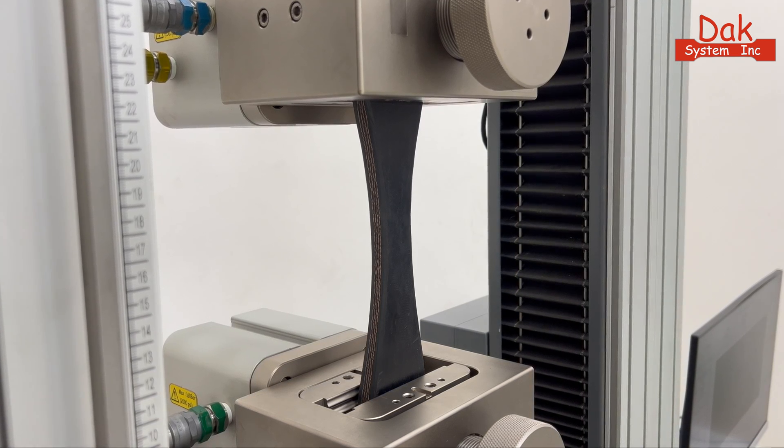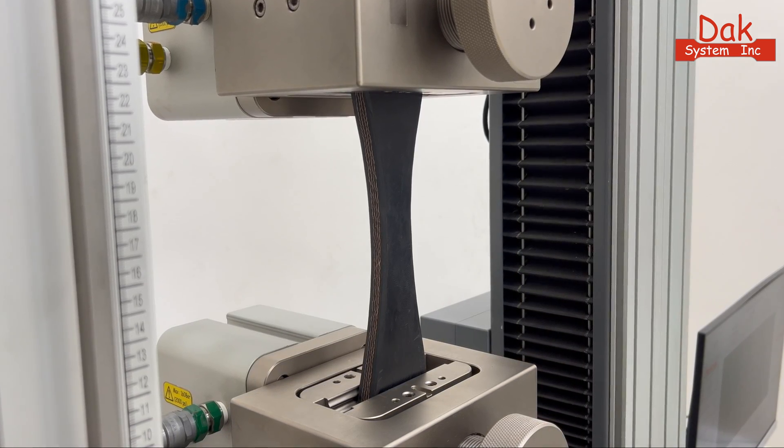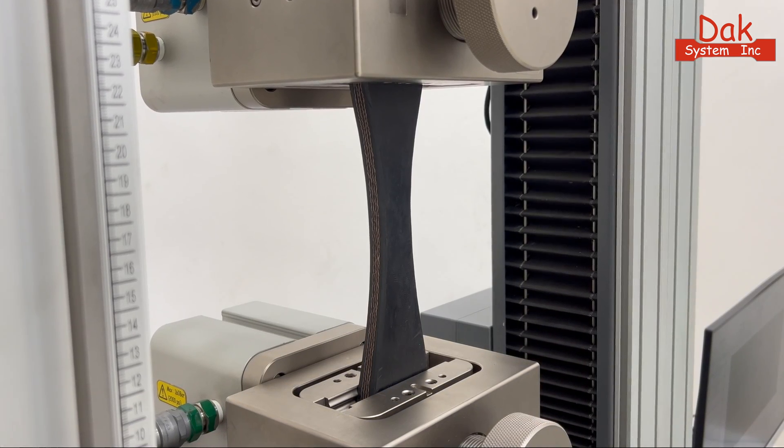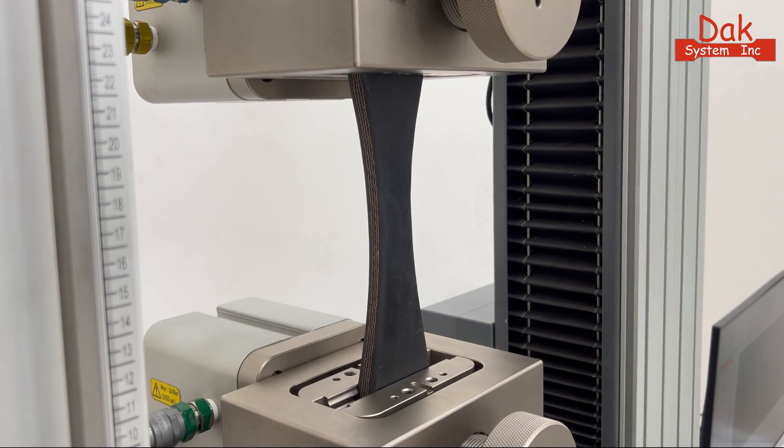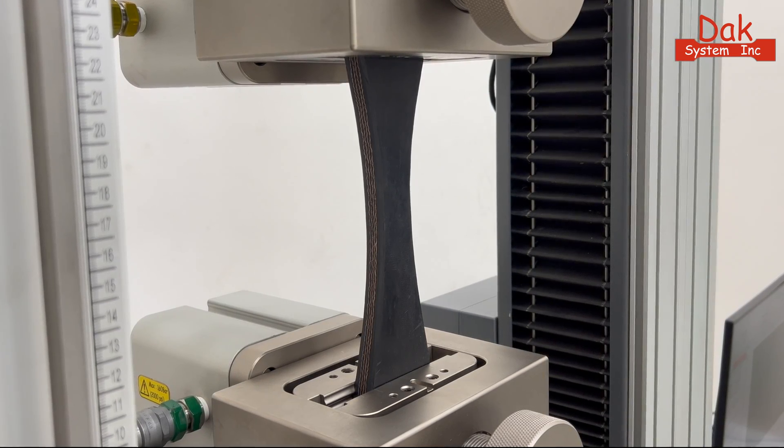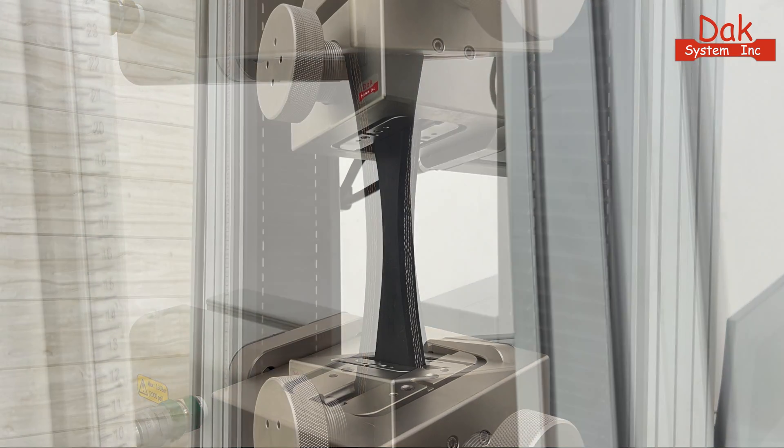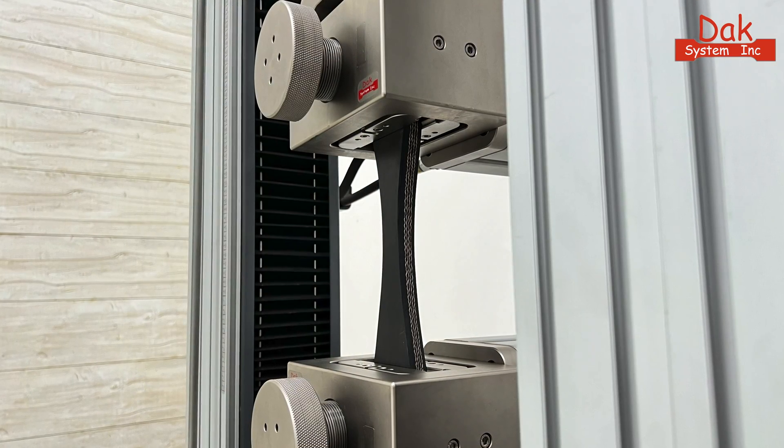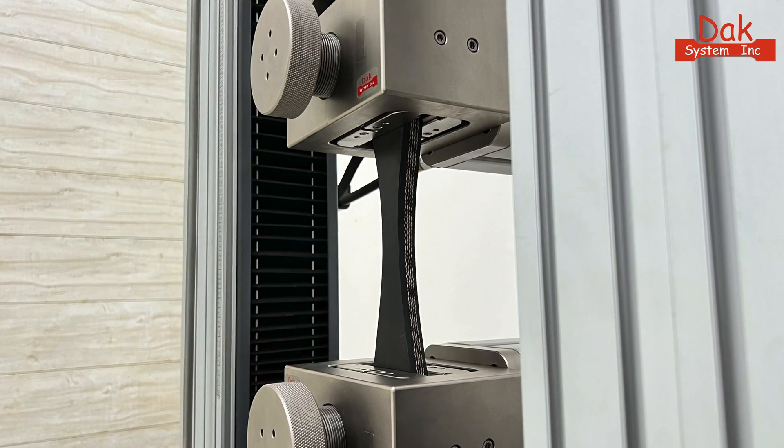Harnessing DAC's pioneering load synchronized gripping technology, this cutting-edge feature ensures gentle clamping, eliminating any risk of specimen buckling.